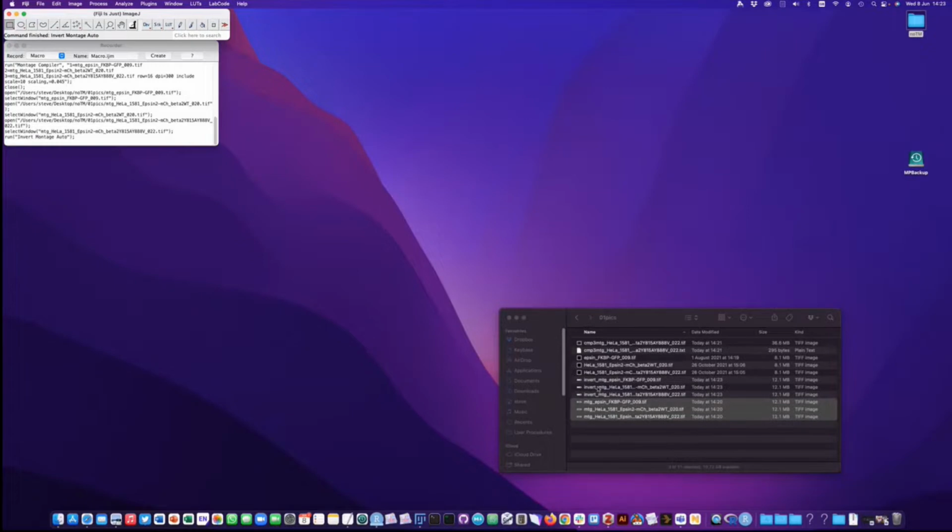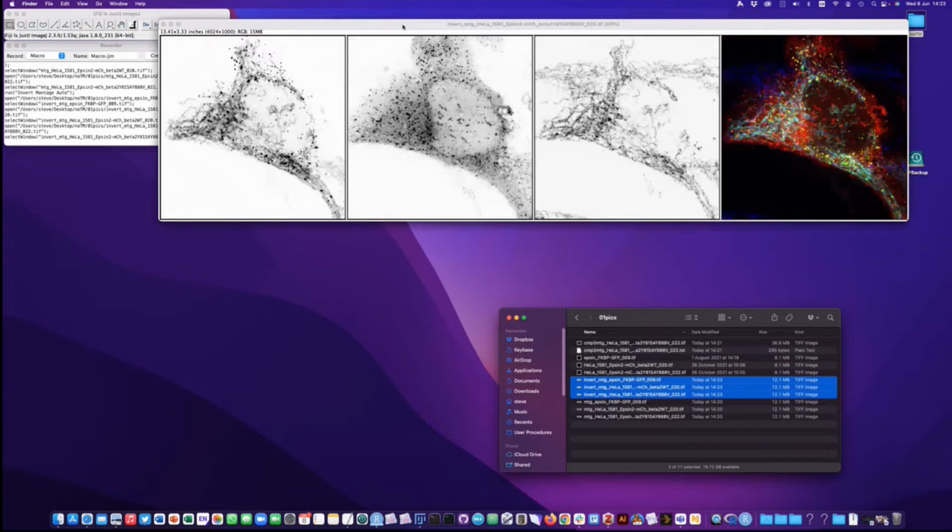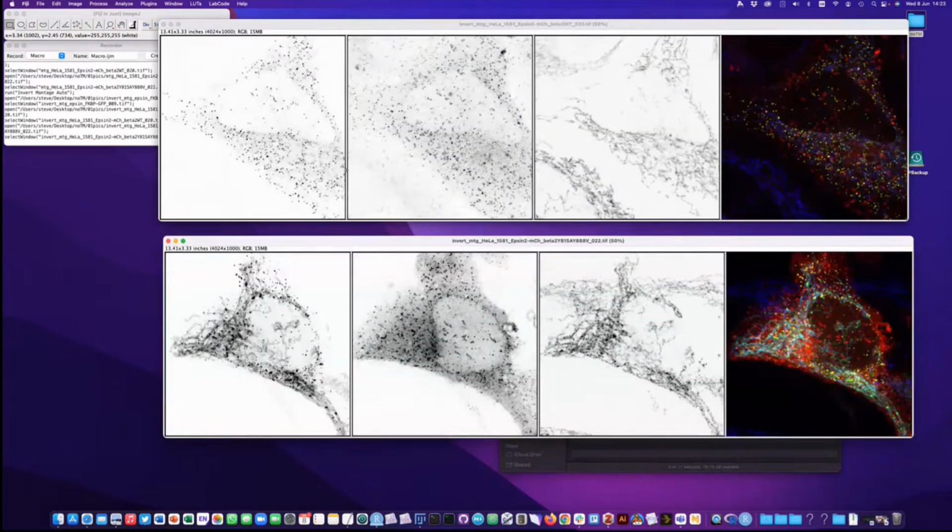And now what we get is different versions of those montages that have been inverted. So the black to white is changed from white to black, and we now have a border on the inside of each of those frames, because the image is mainly white, and with a white grout it looks a bit weird if you don't have a border. So there's the border there.